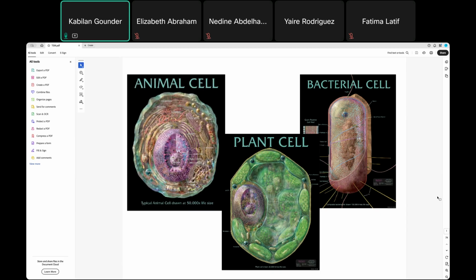Likewise, in the transmission electron microscope, instead of bouncing back, the electrons penetrate your samples so that you will see the internal structure. That is the basics of the transmission electron microscope. Here also the electron is the light source, similar to the scanning electron microscope.